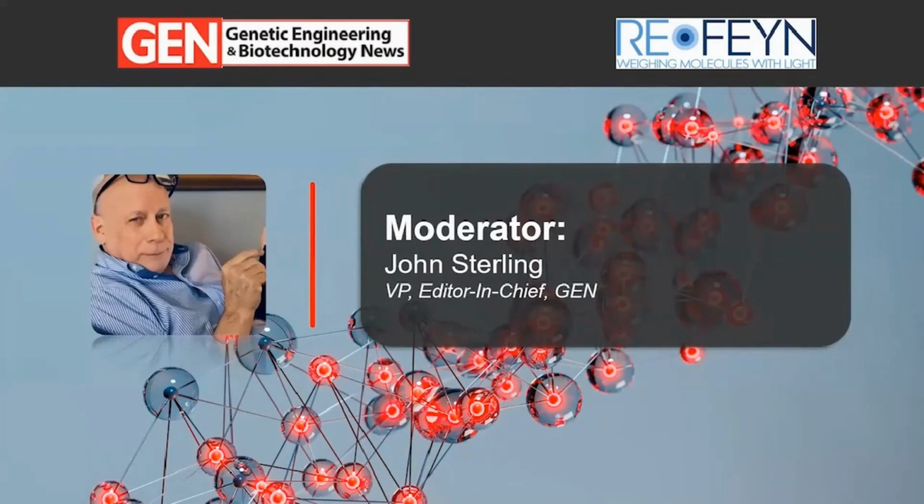Size-exclusion chromatography is widely considered to be the gold standard analytical tool for assessing nanometer-sized aggregates and is often combined with multi-angle light scattering to enable the determination of molecular weight and size. However, the technique can be complicated by several factors, including column and mobile phase optimization.